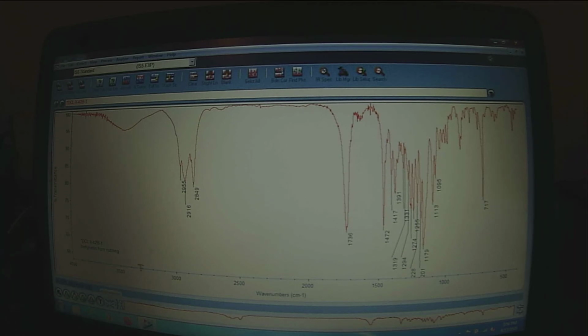By using the annotation tool, I can actually drag those peak labels so they're conveniently different from each other. And I can get it to select peaks that it didn't otherwise select. By holding the Shift key down and clicking on that peak, I can get it to find the center of that peak and actually label it. If you make a mistake, you can simply hit the backspace key and enter, and it will make the peak go away.